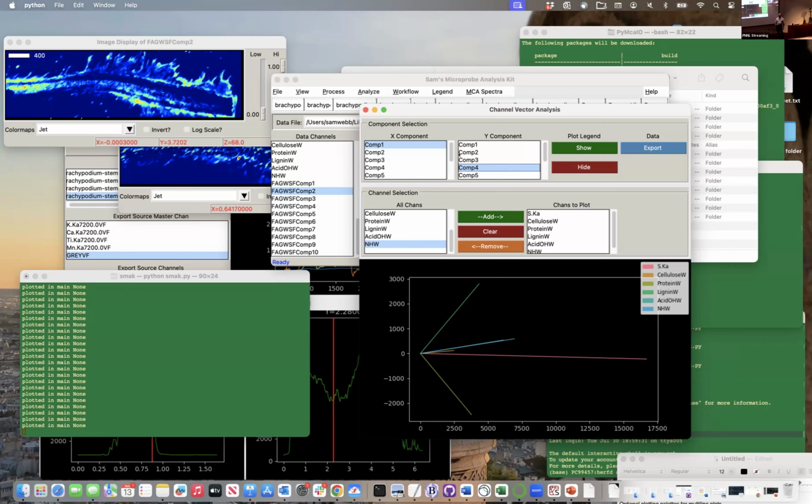Whenever I see K-means, K-means is very straightforward, easy to do. It's quick, it's great, but it's a completely geometric analysis. It looks at all your multidimensional space and splits it up as evenly as possible. For better or worse, that's what it does.